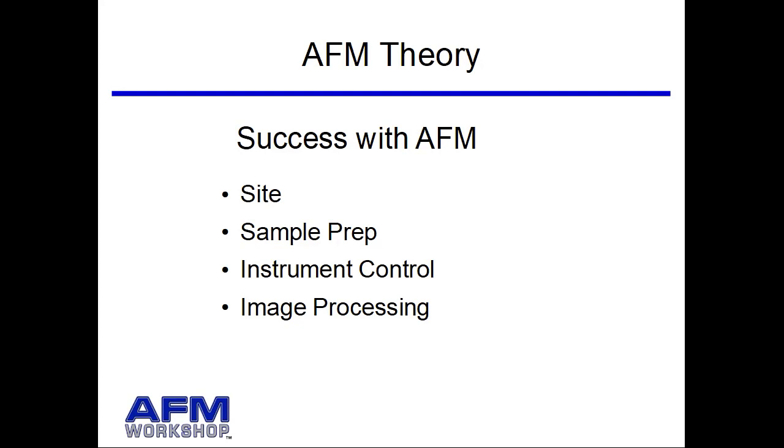Number 2, learn how to do sample preparation. Take some time and read about it a little bit. Number 3, learn how to control the instrument: what the basic controls are, how to get the tip on the surface, how to do a scan, and what scan rates to use. And then finally, number 4, you have to do image processing. I said this earlier, you can expect from the start that it's about as much work or effort as you would spend to learn how to drive a car. And if you're willing to invest that much time and effort, you'll be very successful with an AFM.